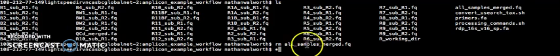So it can match a letter like this R here, it can match a number like this 6, it can match an underscore, it can match anything that you need when you're doing bash language, which is really, really useful. And so we will use it to match everything all at once, and I'll show you what I mean in a second.